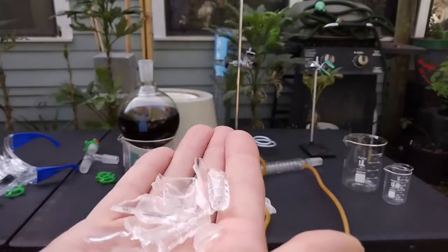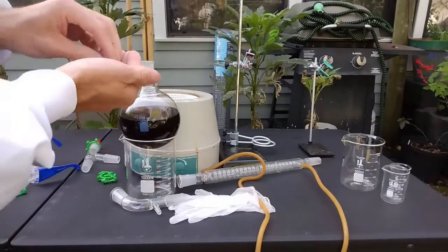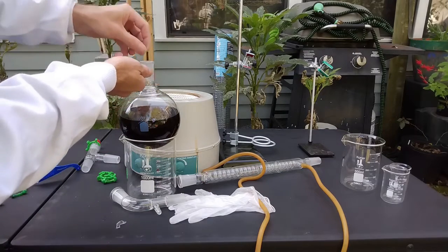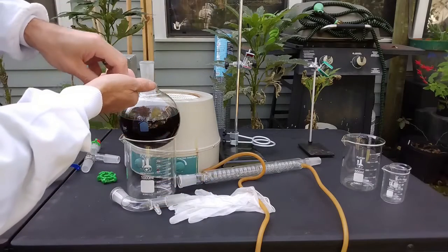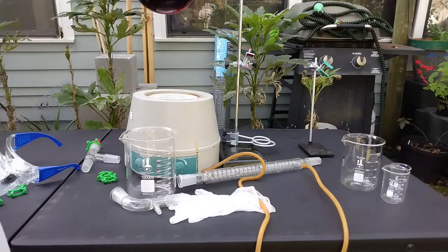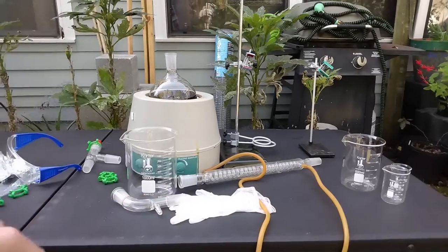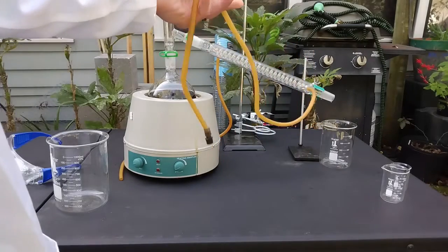I have some pieces from an old condenser and I'm simply going to put them in the flask. The advantage of using glass is that it won't react with the sulfuric acid. Now I'm going to set up the apparatus for a simple distillation.